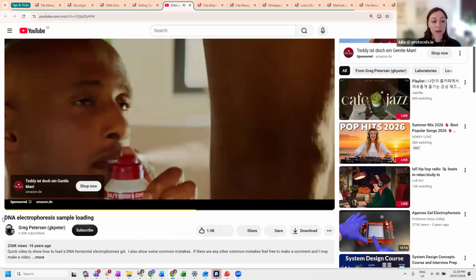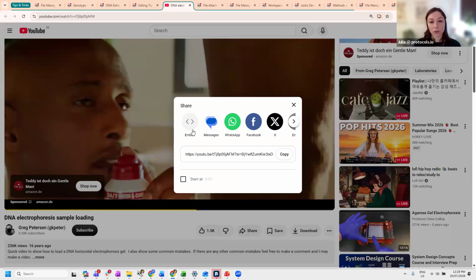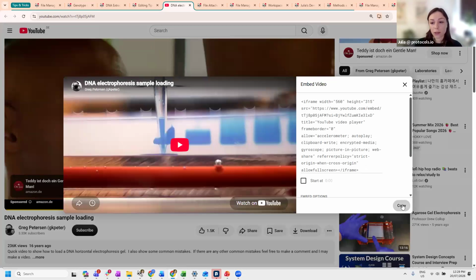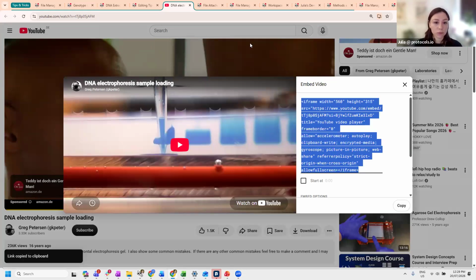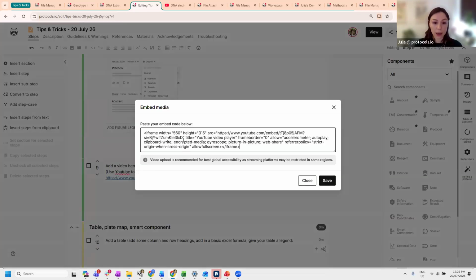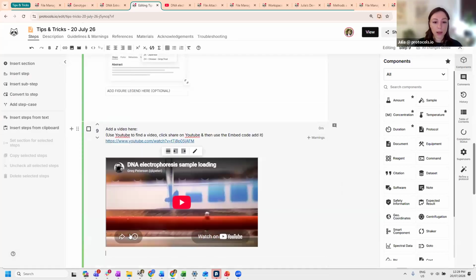So this is a video on DNA electrophoresis. So if I go ahead and I click share, what I can do is I can embed this video into my protocol. So make sure after clicking share that you click on embed and then copy this text here. And when it comes to my protocol, I can then go up to this embed media, paste that information in and save that. And so then I have that directly into my protocol.